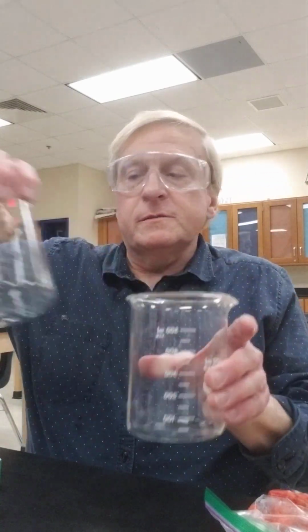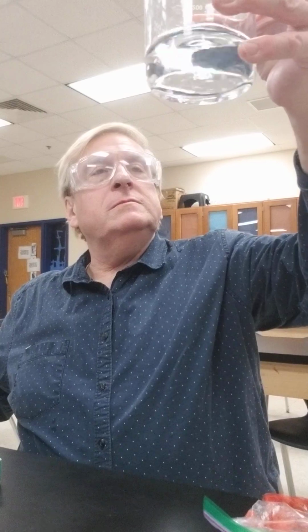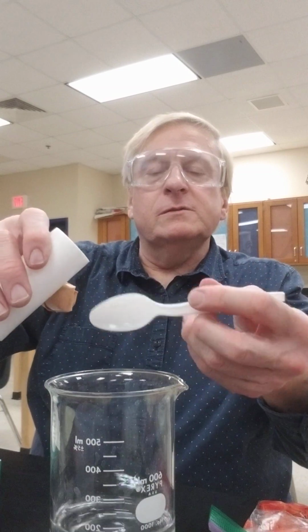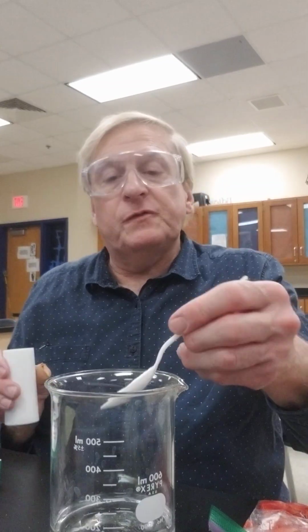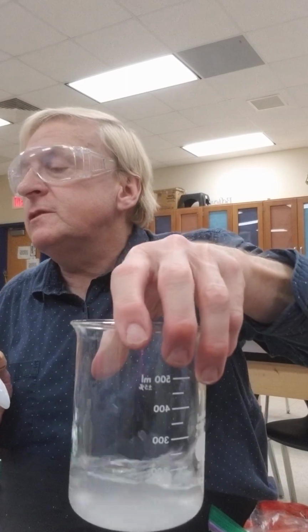Well, this is being smashed up here real good. I'm going to take one of my 2 beakers. I'm going to put about a half a cup of water, which, let's see what that is in milliliters, about 120, 130, something like that, about 120 to 130 milliliters of water, or half a cup. You need to take a teaspoon of salt. Teaspoon's your smaller spoon. It's not a tablespoon, a teaspoon's fine. You swirl that all up in there real good.